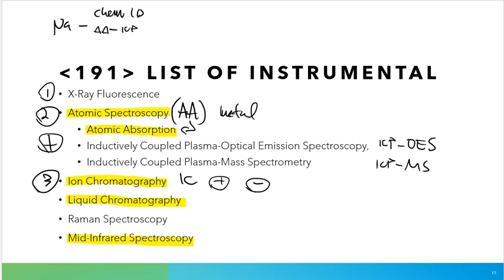So sodium can be analyzed with AA or ICP. Next up, ion chromatography. I can take an IC system and make sure that it sees positive pieces, and sodium would be a positive piece. So I can take those same samples, go over to the IC system and say, hey IC, I want you to run all of these, please. I can load up however many the autosampler can hold, and then I allow that instrument to take over, and it will tell me if sodium is present, and if so, how much is there.